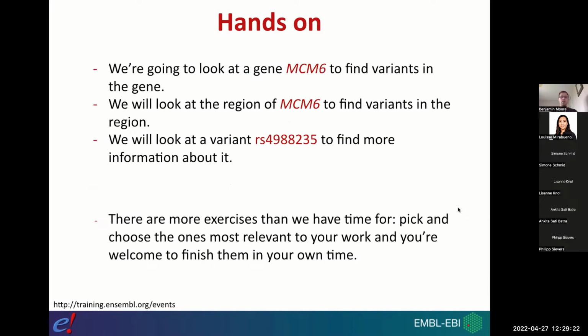Okay, so what I want to do now is move on to the demo. I'm going to show you how you can access all of this data in Ensembl. I've been keeping my eye on the chat box, but I don't think there are any questions at the moment. Before we start the demo, are there any questions that came up from the presentation? I'm happy for you to put them in the chat box or the living doc, or you can even unmute yourself and ask. Great. Okay, if there are no questions, I think we'll start with the demo. You can always put the questions in the chat box as we're going through as well.